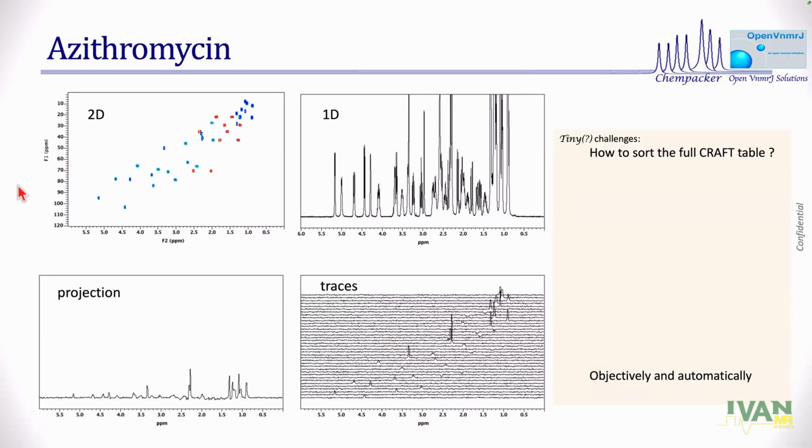It shows reasonably fine, but that's not what I want fundamentally, because I really want a sum projection of these peaks. I don't want a trace. I want a sum projection of every individual cross peak in there, that represents a proton in this dimension and that carbon in that dimension. So I want to resolve sum projection, not traces.